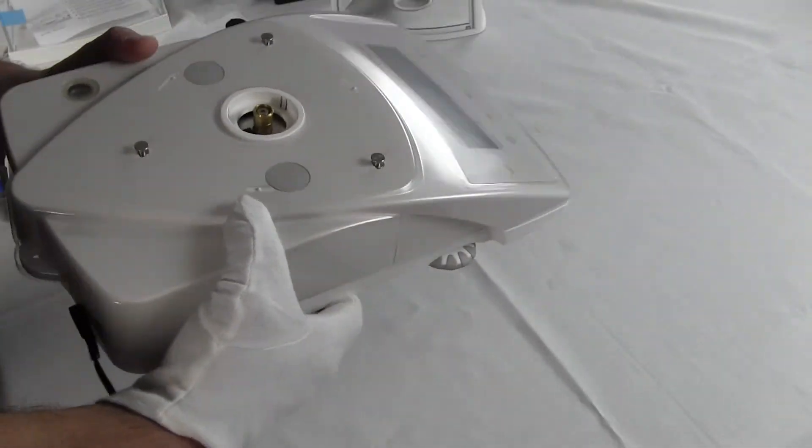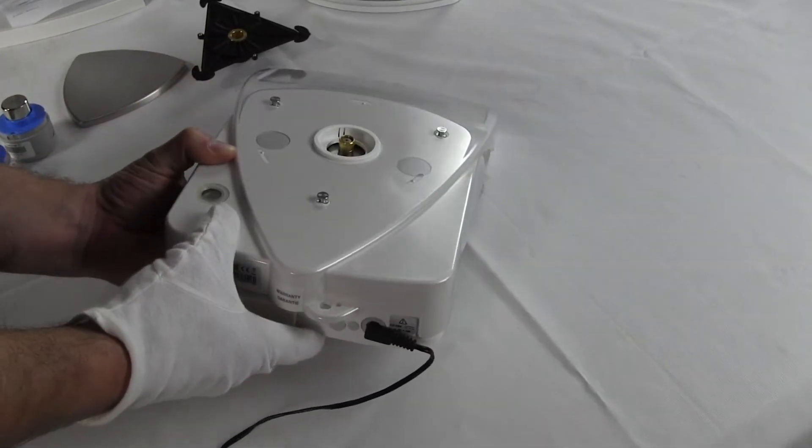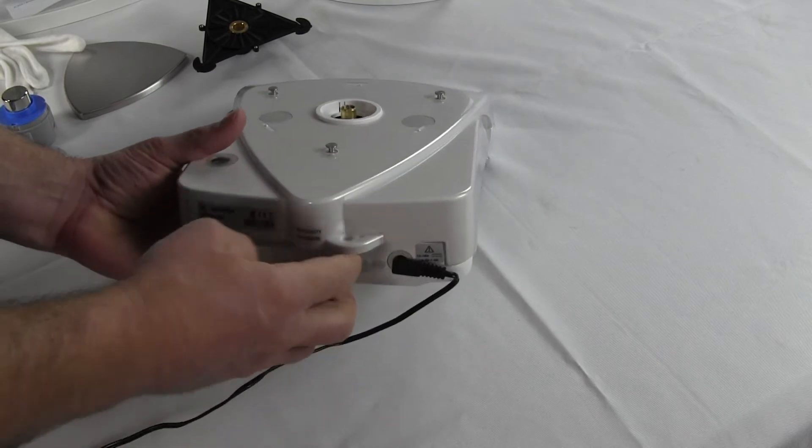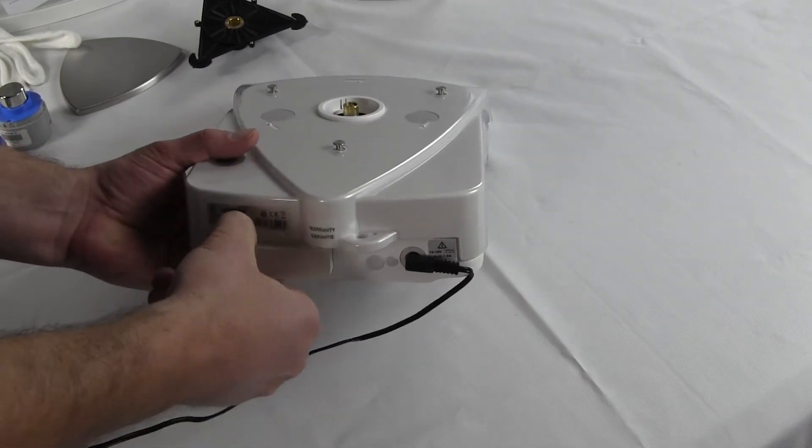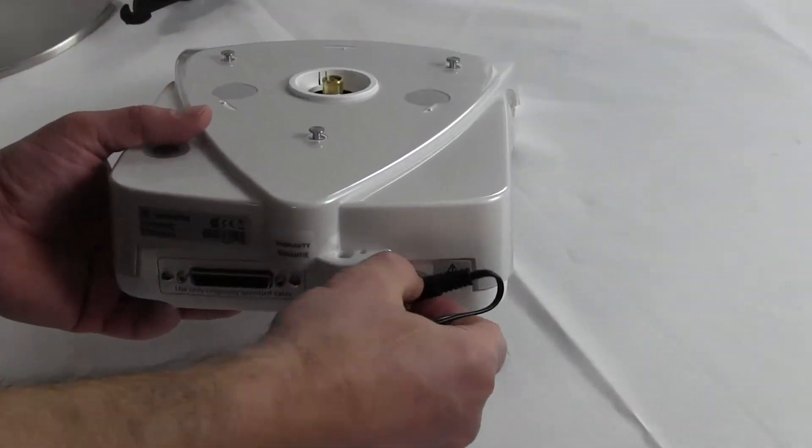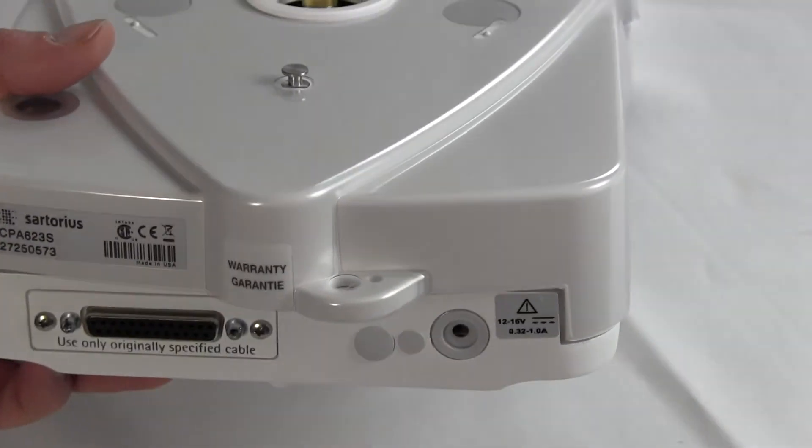To the rear of the balance, we have an RS-232 port. Let's take off this glove so I can show you a little bit better. We have an RS-232 port here. If you wanted to connect the balance to a PC or a computer, we have an AC adapter port that plugs in right here.